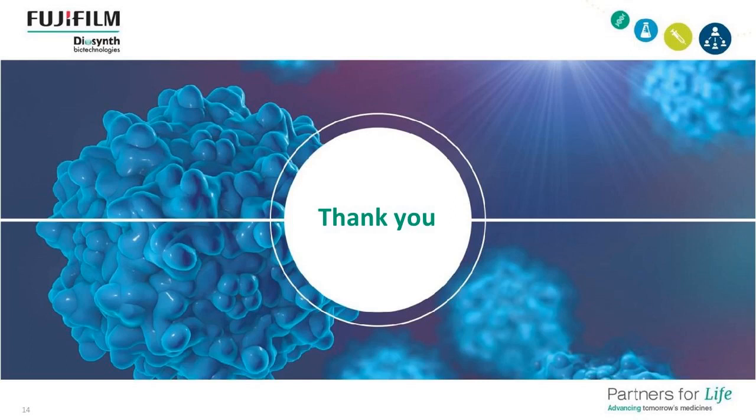I didn't hone in on that bit, but the flexibility angle of this is really incredible. This week we did a series of engineering runs with the product where we were screening different component sizes, different stoppers, different materials of construction, different fill targets, and we did 2 engineering fills a day with our staff. So very versatile.